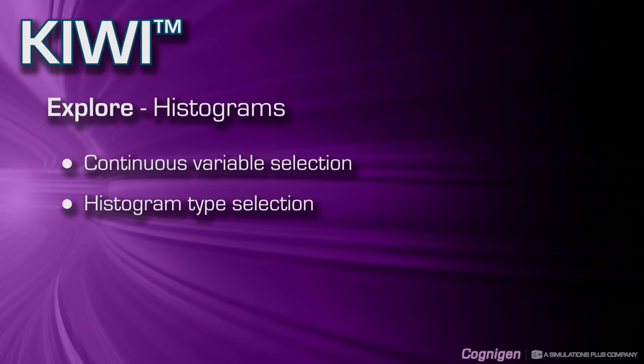Welcome. In this tutorial video, I will talk about the creation and customization of histograms in the KIWI Explore module.